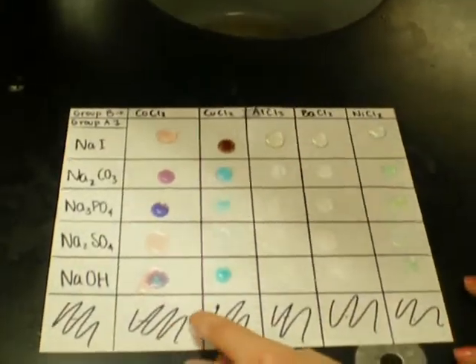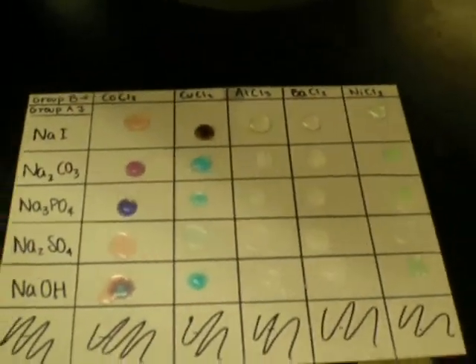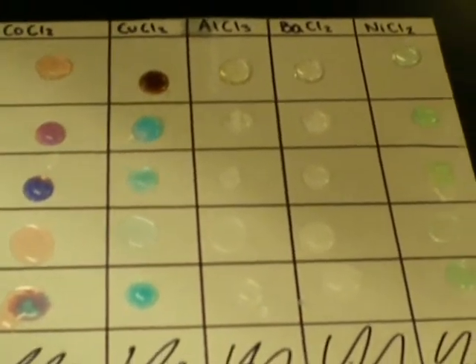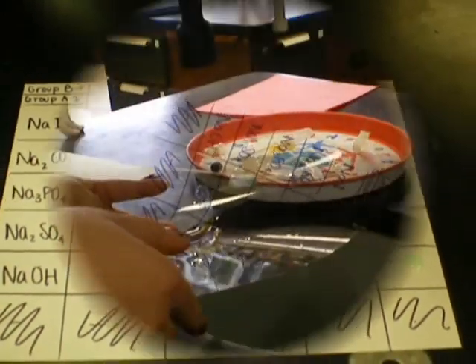Alright, so these should be the final results of your lab. As you can see, some of them changed color, like NaOH and CoCl2, and others didn't, like NaI and CoCl2. But what you're looking for is to see the cloudy stuff, like in Na3PO4 and CoCl2. That is an example of precipitate. Also, another example is Na3PO4 and CuCl2. But we need to show... I'll zoom in. So this one, you have it there.